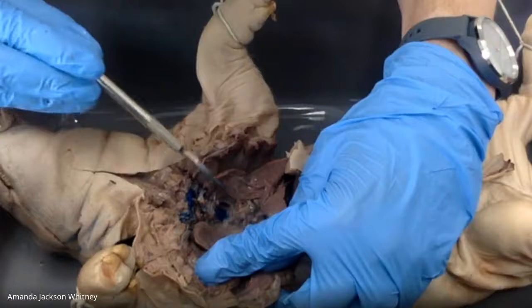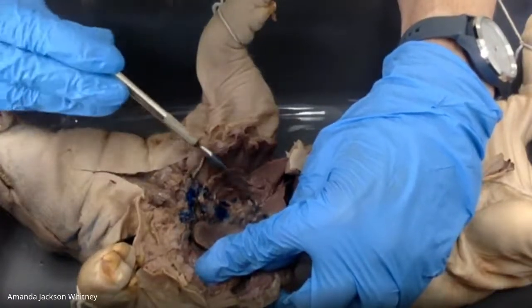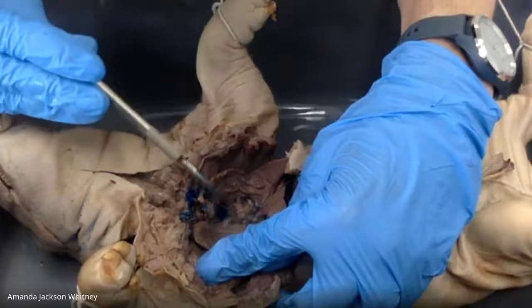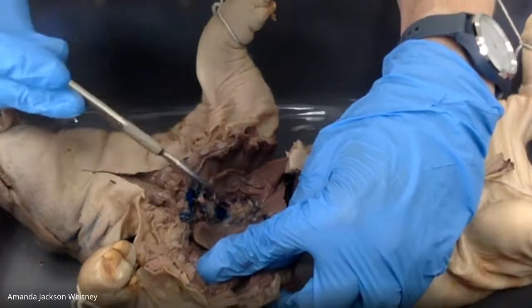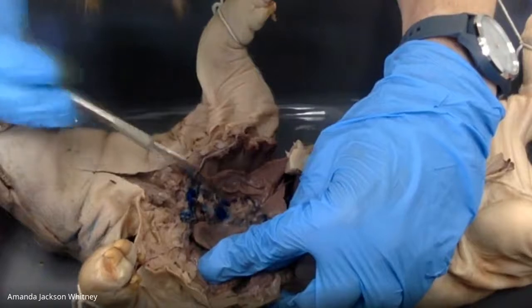So these are what's bringing blood towards the heart and away from the heart. I can't tell which are which because literally everything is blue, but these pulmonary blood vessels are bringing blood from the heart to the lungs, and then from the lungs back to the heart. So that's pretty cool. At least I think it is.